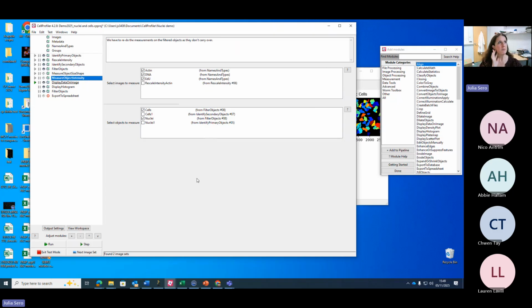You should never only get your parameters optimized for a single image, because maybe you just happen to choose the one weird image that is not like the others, or maybe different treatment conditions cause different cell shape changes or differences in intensity, and you want to find either a sweet spot where you get really good segmentation for all of those, or you might need to divide it up because you just can't find a set of parameters that works for everything.